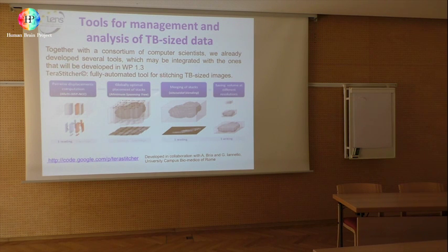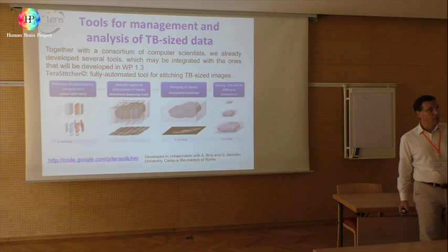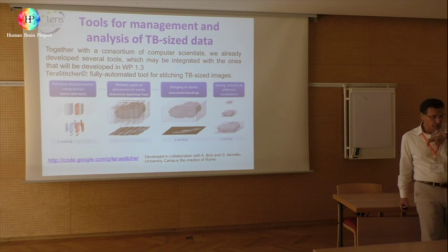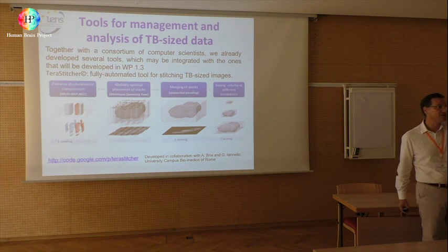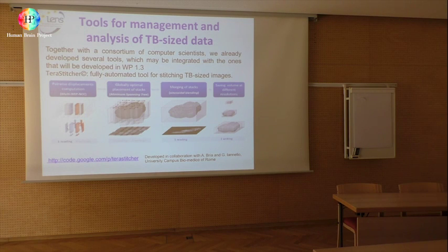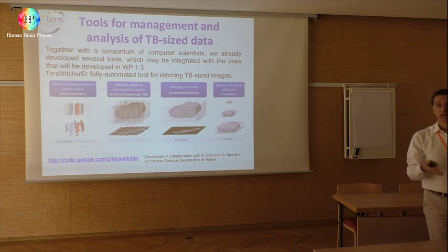Because then you have hundreds or thousands of stacks, and you have to stitch everything together. So we have a fiber optic link from our center in Florence to Cineca and to Zurich. So we transfer our data to the supercomputer with these dedicated fibers, and then people from outside remotely upload their instruments to visualize data.